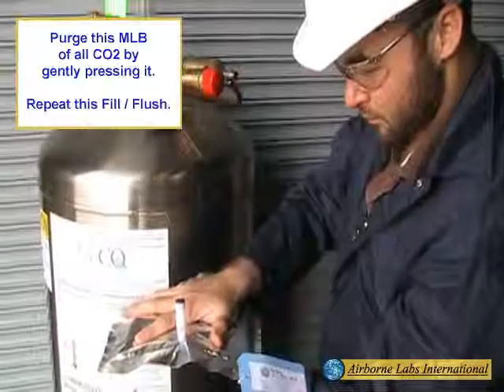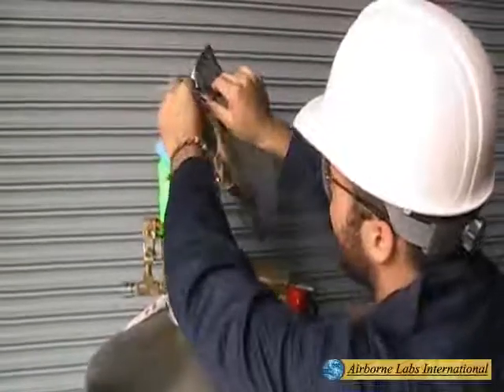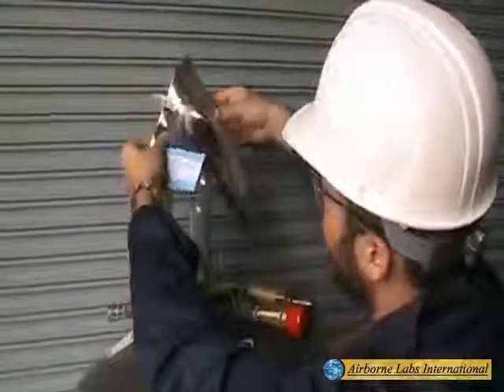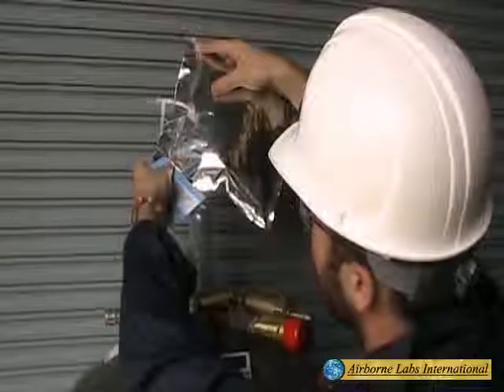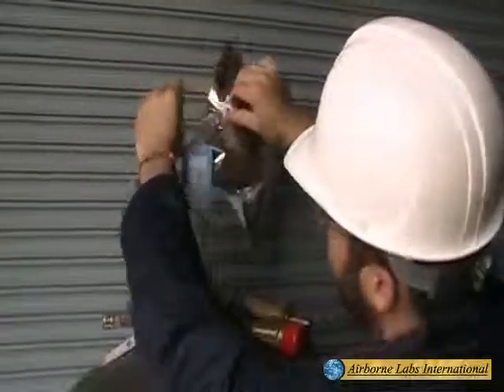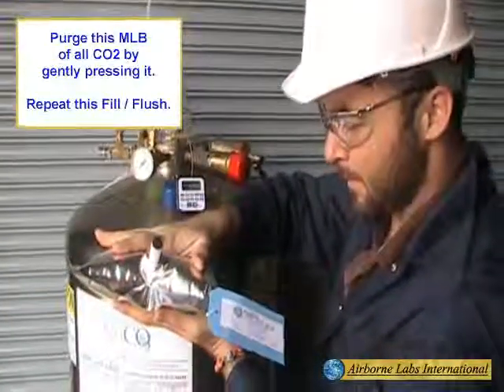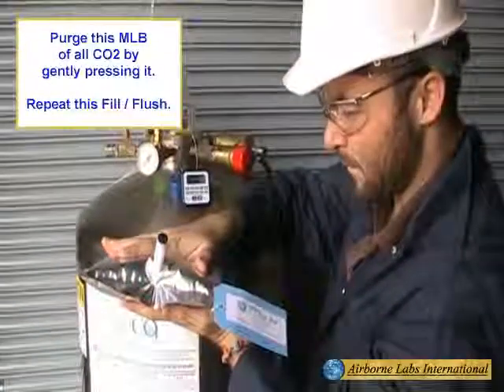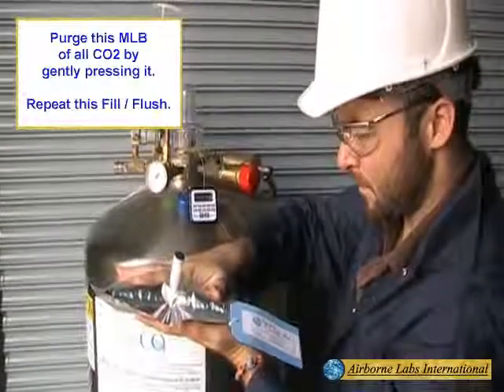Repeat this fill flush process. This filling process can be accelerated if needed by gently pinching the soft Tygon tube part of the T-Fitting. Do not overfill an MLB, as this can cause it to leak or violently rupture. Next, purge this bag of all CO2 by gently pressing it.